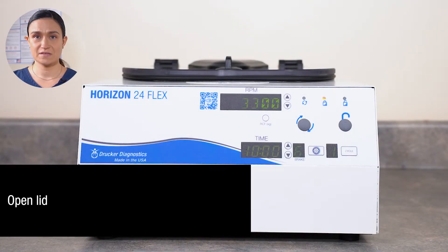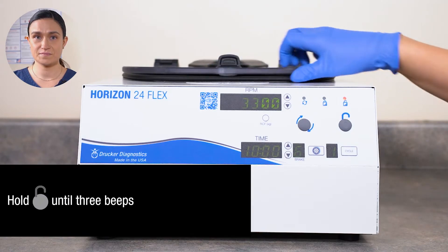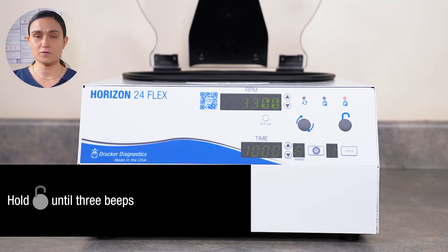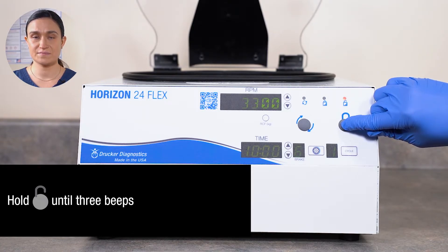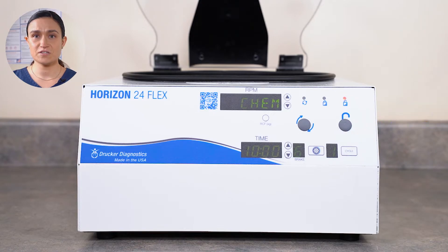To disable the lock, start by opening the lid of your centrifuge. Press and hold the stop/unlock button until you hear three beeps. Your centrifuge is now back to factory standard operation.